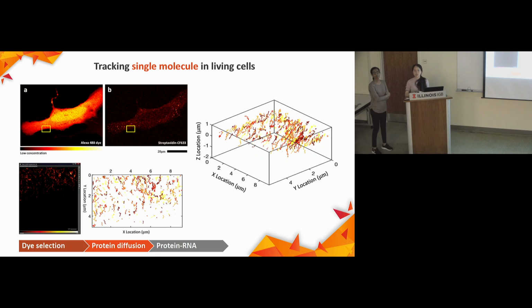So then do you see quality changes or length of tracking changes depending on whether the molecule was measured earlier in the experiment or later? Could you repeat your question? So you're asking whether the result is going to change if I track it earlier or later. Well, I don't know, because you cannot track the same molecule again.